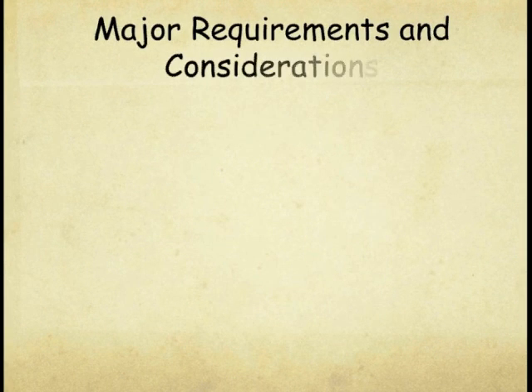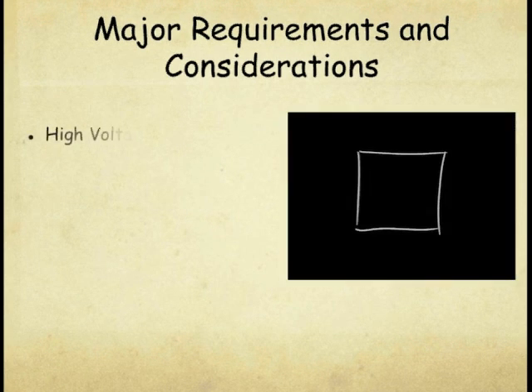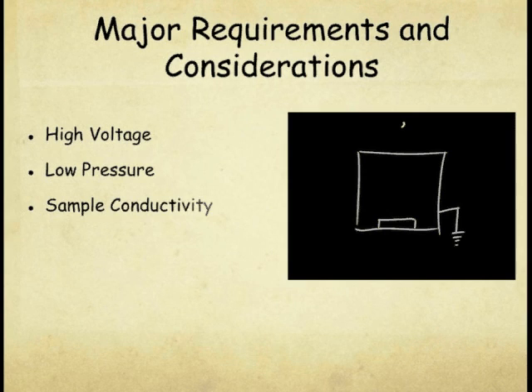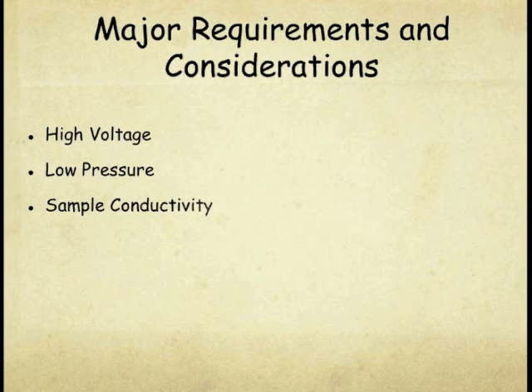Another important concept will be the major requirements and considerations for operating an SEM and getting good images with adequate resolution and contrast. The major requirements are a high voltage source, low pressure, and sample conductivity.